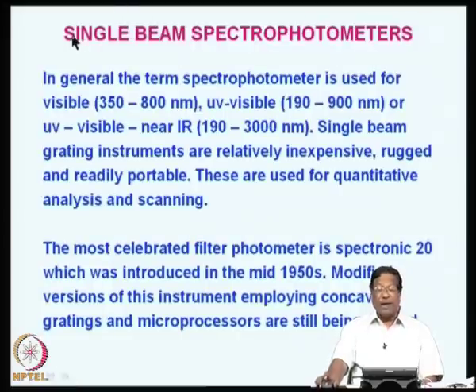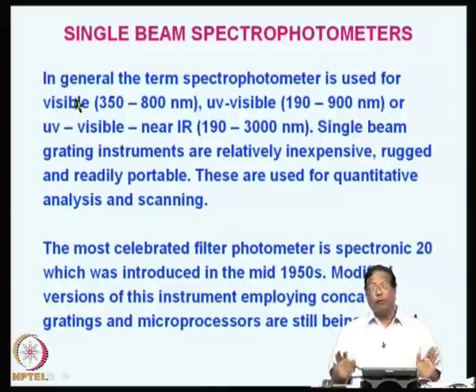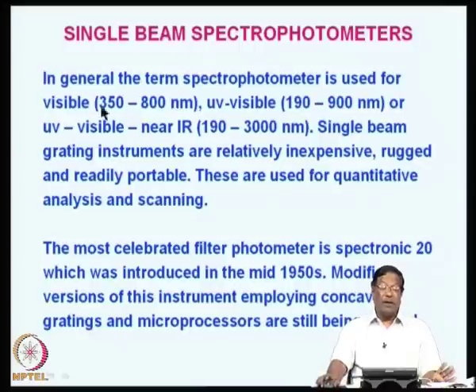Now, the slightly higher end equipments are single beam spectrophotometers. In general, the term spectrophotometer is used for the visible range, and that is 350 to 800 nanometers. If you have UV, then the range would be 190 to 900 nanometers. They are also called spectrophotometers, but UV visible spectrophotometers. Otherwise, for 350 to 800 nanometers, what we see here are simply called spectrophotometers.